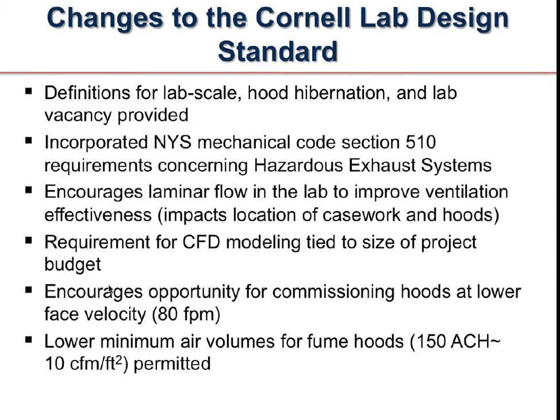The standard also encourages the putting in of hoods that will contain well at 80 feet per minute. I understand probably several people on the phone have fume hoods on their campus that go much lower. We would like to be able to commission standard fume hoods at 80 feet per minute.